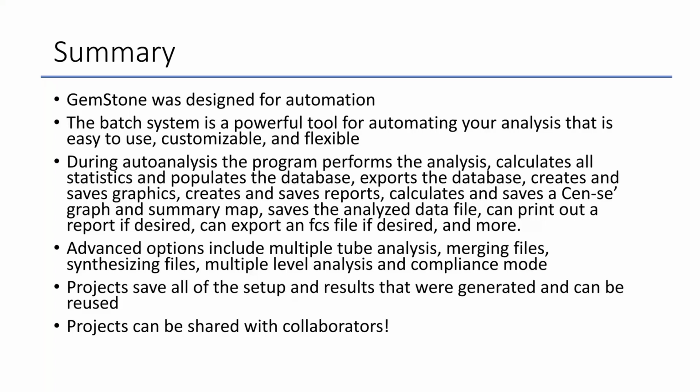So advanced options include multiple tube analysis, merging files, synthesizing files, multiple level analysis, and compliance mode. Projects save all of the setup and results that were generated and can be reused. And really importantly, projects can be shared with collaborators. So if you have multi-site studies or multiple users trying to use the same panel, these projects can be shared and all of that program can be copied from one place to another.